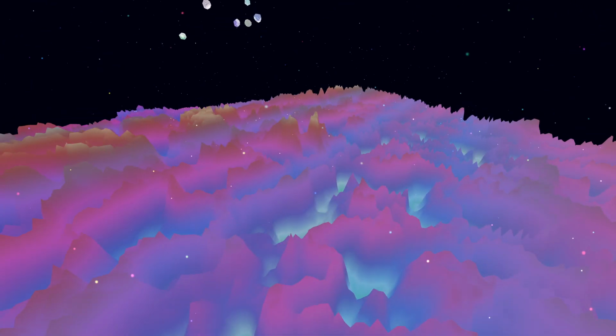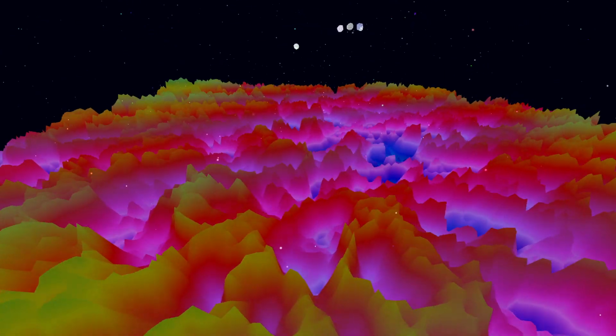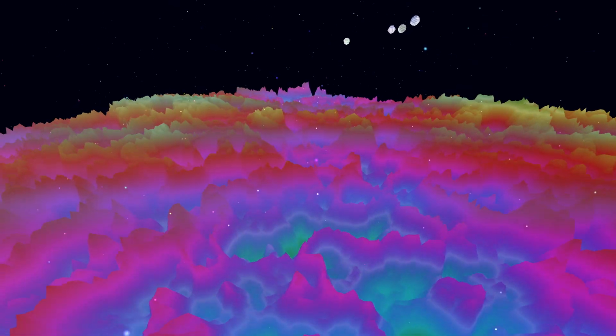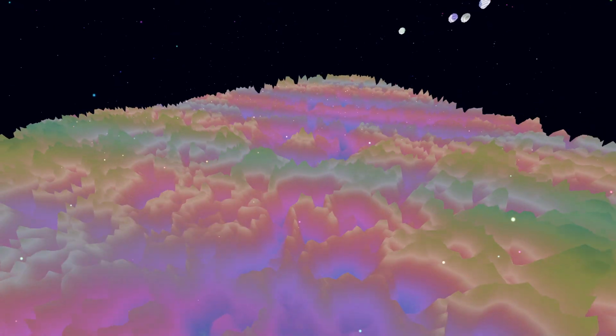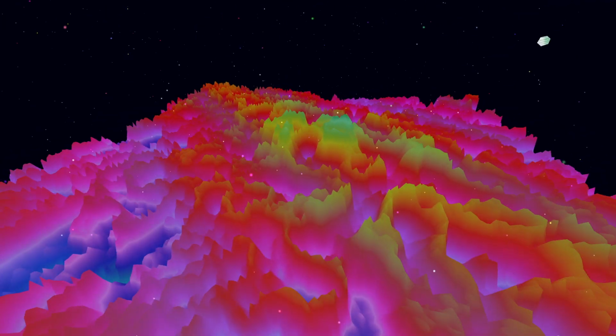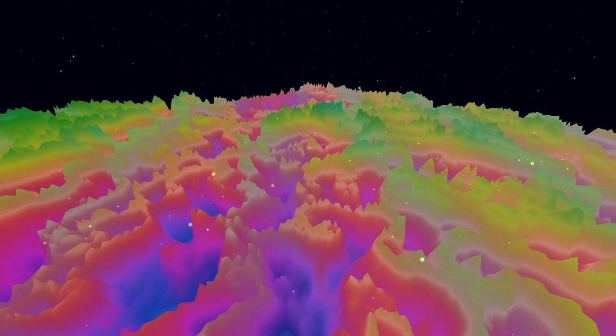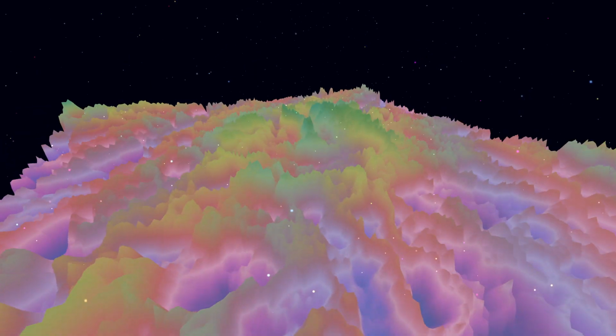And the height, or actually the area under the peak, tells you how much of that element or state is there. That's right. The peak area is proportional to the concentration. We often have to apply something called sensitivity factors because some electron levels are just inherently easier to eject electrons from than others. But yes, intensity relates to quantity.